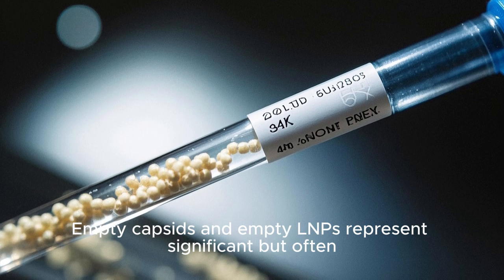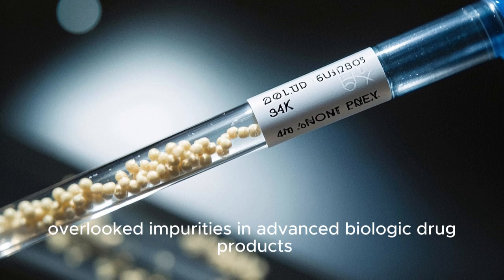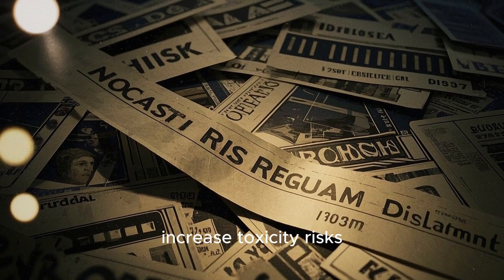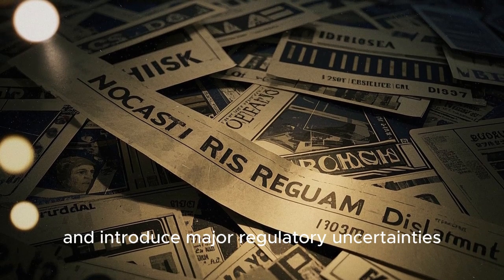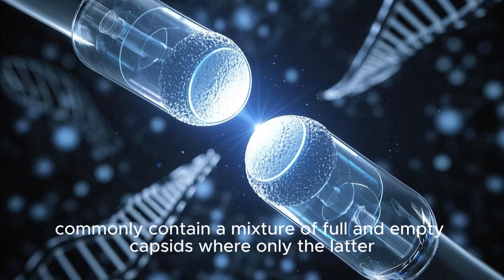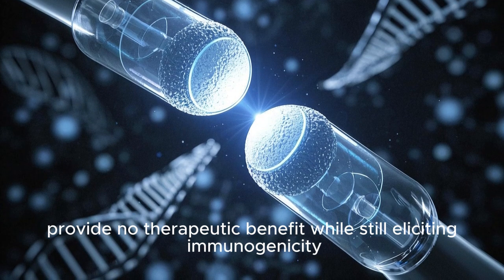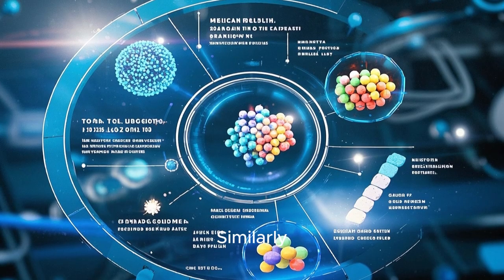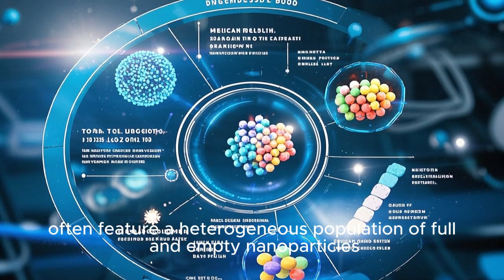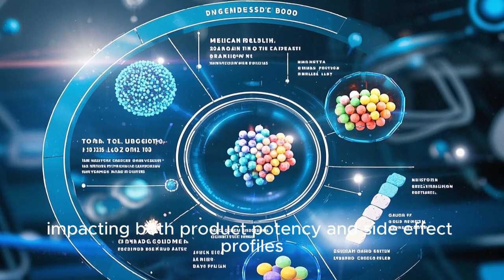Empty capsids and empty LNPs represent significant, but often overlooked impurities in advanced biologic drug products. Their presence can compromise therapeutic efficacy, increase toxicity risks, and introduce major regulatory uncertainties. In particular, gene therapies using viral vectors like AAV commonly contain a mixture of full and empty capsids, where only the latter provide no therapeutic benefit while still eliciting immunogenicity. Similarly, mRNA therapeutics and vaccines formulated in LNPs often feature a heterogeneous population of full and empty nanoparticles, impacting both product potency and side effect profiles.